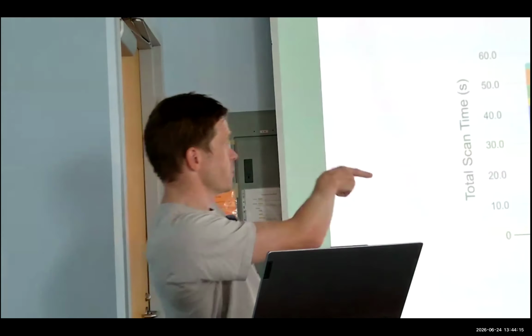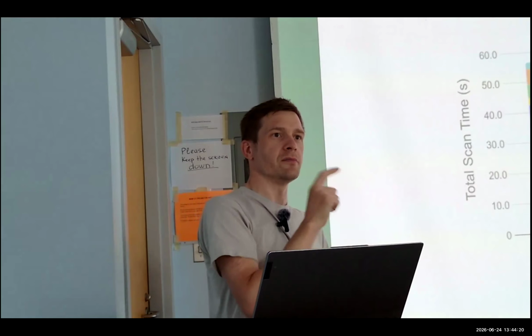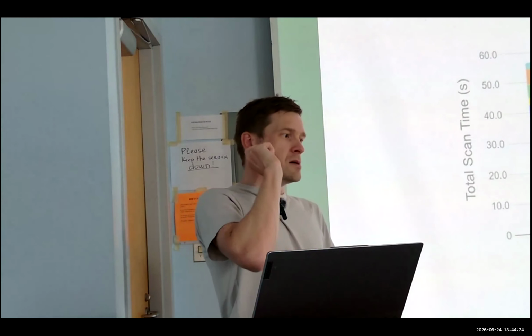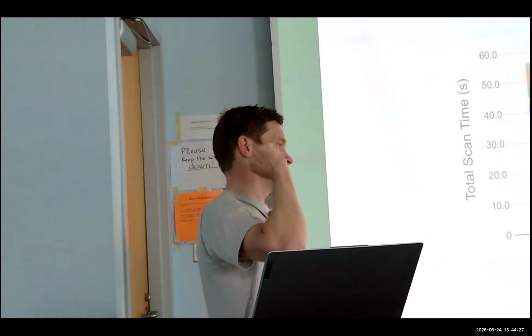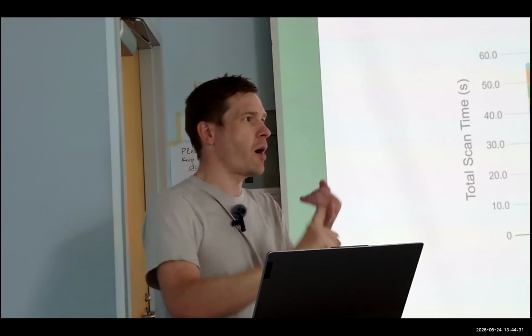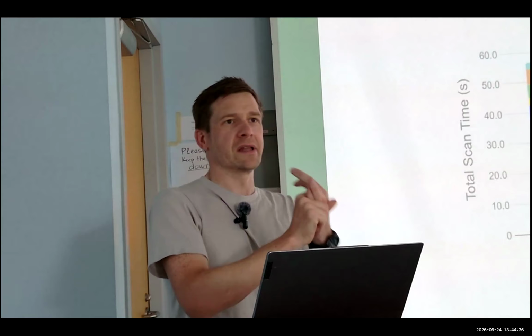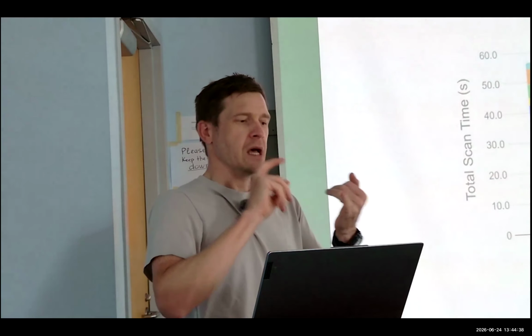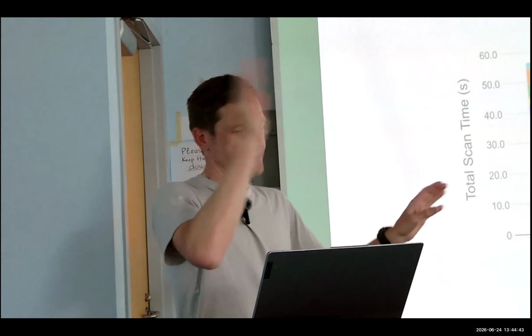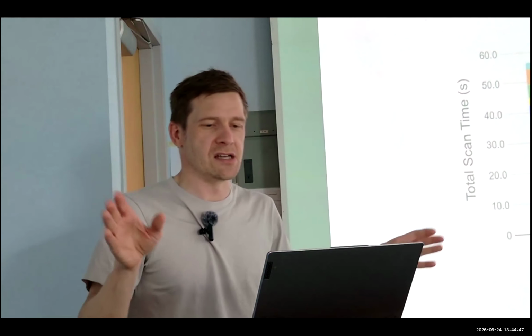I will also point out, with this graph, there's some free microscope software out there called Micromanager. I don't know if any of you have run into it. Micromanager is atrocious in terms of optimizing motion profiles and running quickly and throughput. The software stack is really janky, and it's really slow, and it does a bunch of unnecessary movements.